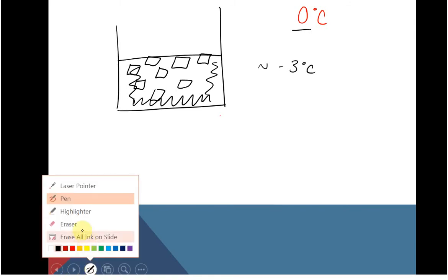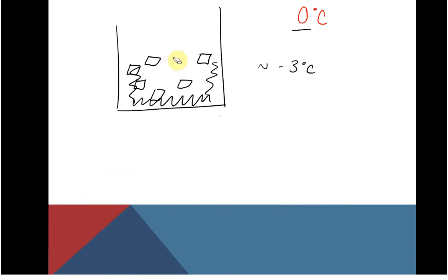Now, then what you're going to do is you are going to then take your test tube, and you have this really huge one actually this time, and you are going to have a stirring rod, which is actually not really a stirring rod. It looks more like a spoon of some sort, like a ladle. And you're also going to have a temperature probe.